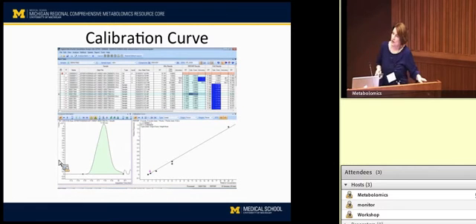So we know what's coming out in terms of the matrix effect, of what's in your sample versus what's in the standard. That part is a little bit of a black box in this particular software, so I can't really show you how it does it. But when I first started looking at the software, I wanted to know how that black box worked, because most of us just don't trust things like that. I went into another piece of software by the same company and manually integrated the peaks there. And lo and behold, if you take the ratio of the raw data to the normalized data, you can tell that it's always been normalized according to the internal standard for that compound. So basically, it's all been vetted, and we know it works.